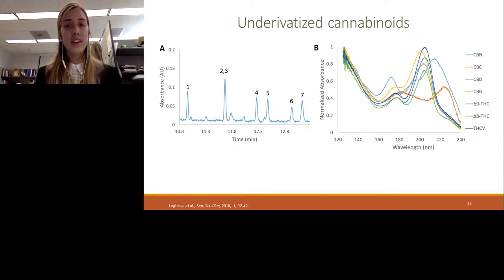So you can clearly differentiate between the different molecules, but also because they all belong to the same class of chemicals, you can see how they pretty much follow a similar pattern, with one absorbance maximum at around 180 and one at 210. So by looking at this image, you can already pretty much understand how these unknown compounds fall under the same class of chemicals.